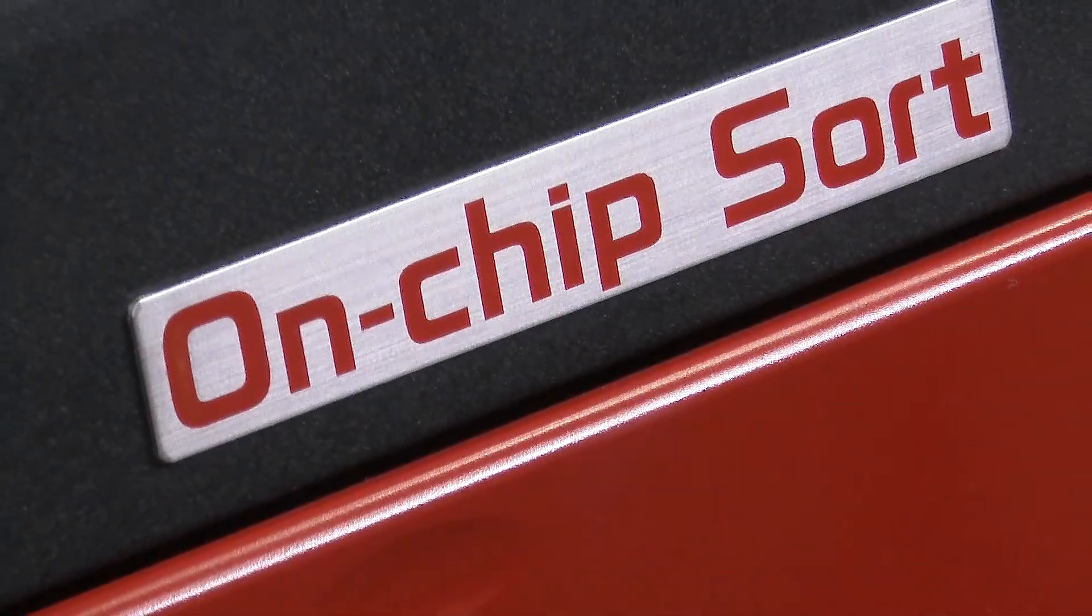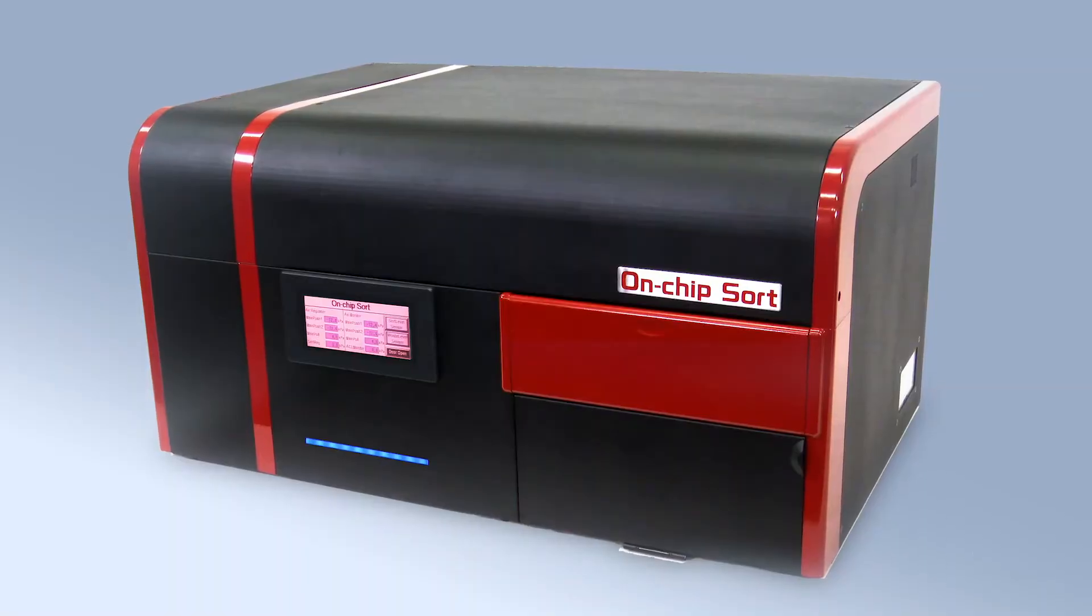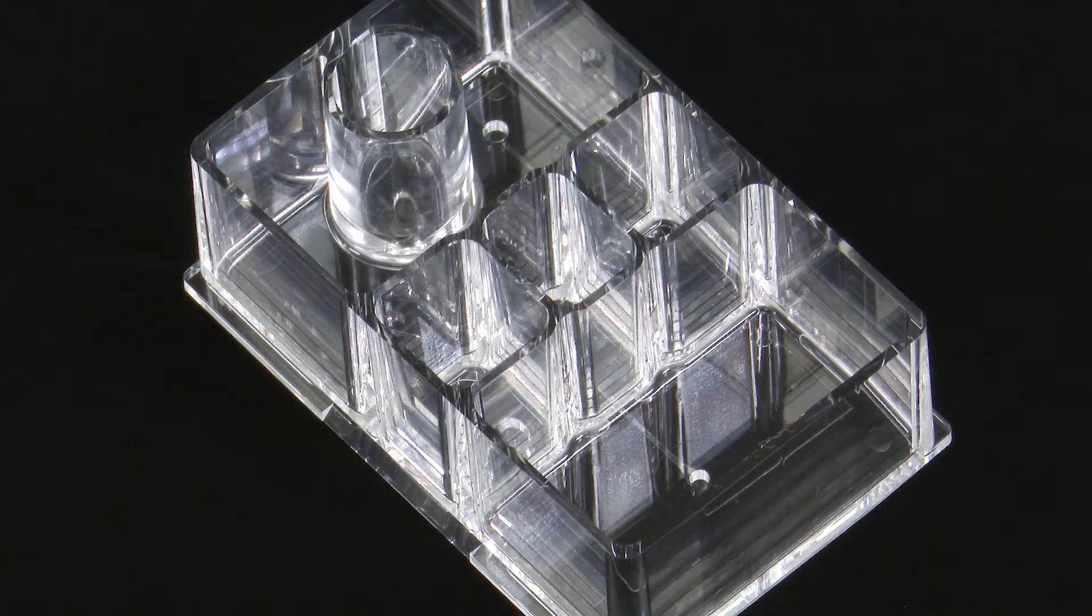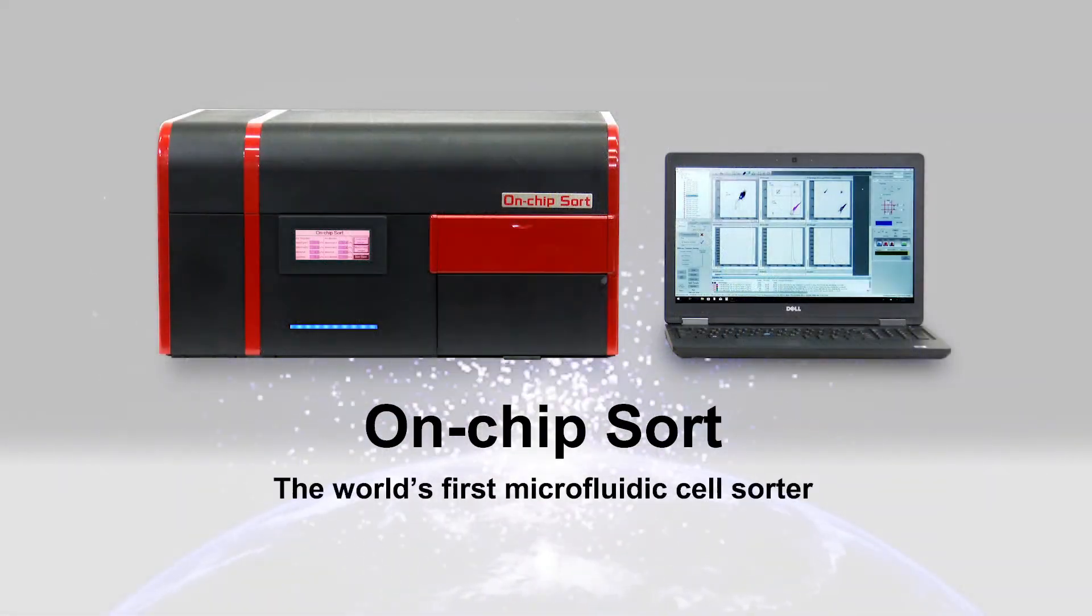The small, revolutionary microfluidic cell sorter. Do what you couldn't with On-chip Sort.